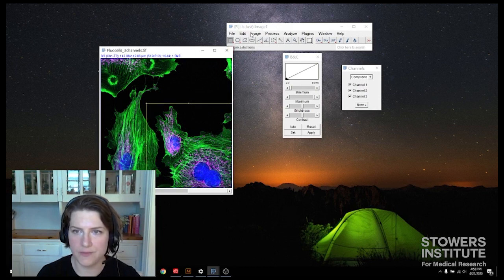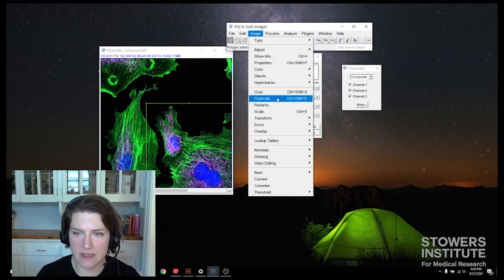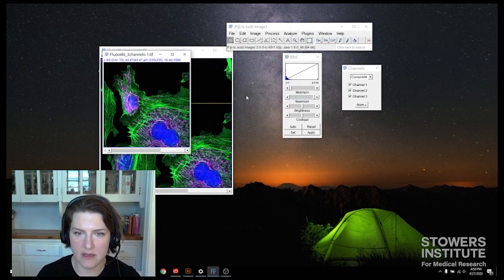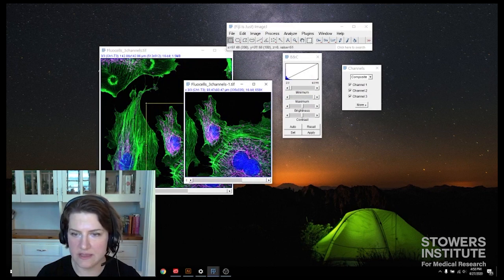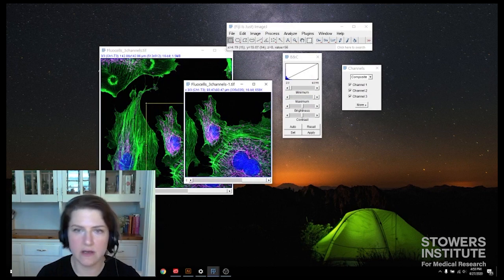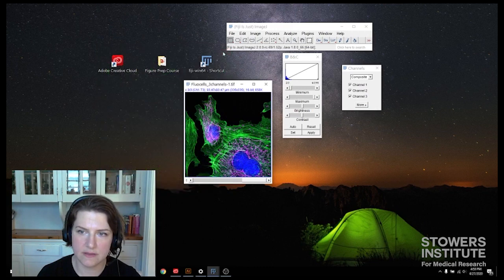And then I can go image, duplicate. I want to duplicate the hyperstack. And then I finally have, this is what I want to appear in my figure. So I can go ahead and close this.